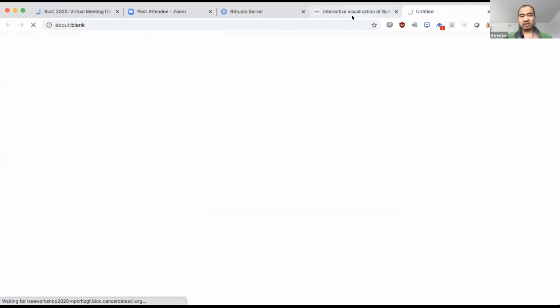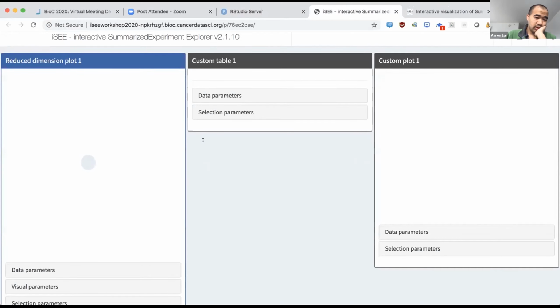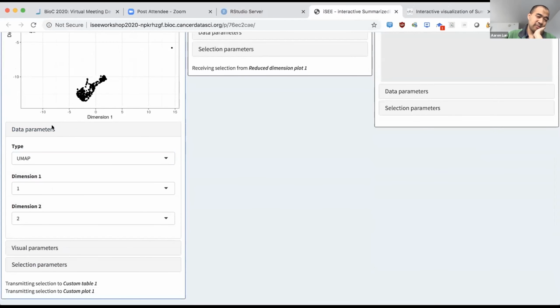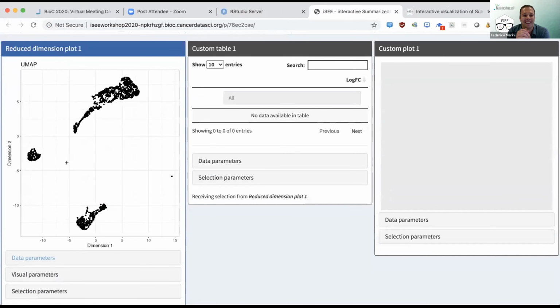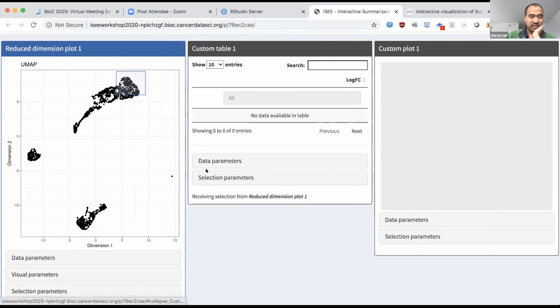and then I open it in the browser, and I move this here, and then I wait. There we go. All right, I'll make a UMAP for you. Fine. So we've got all this, and even if you don't have any clusters, you could say, I want to know what's up in these guys compared to the rest.